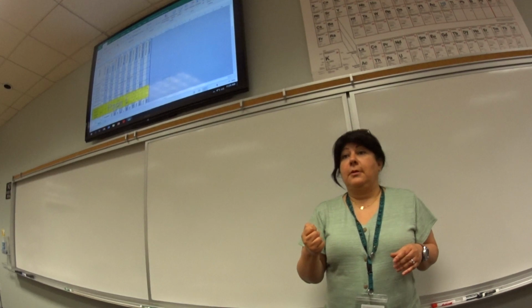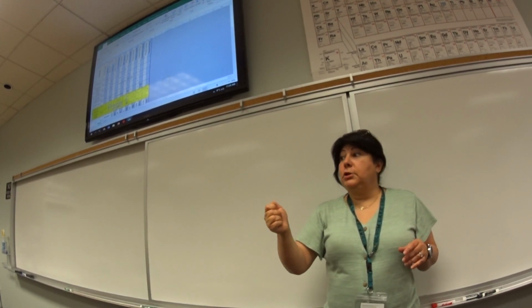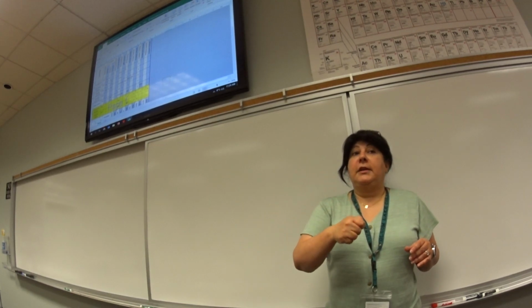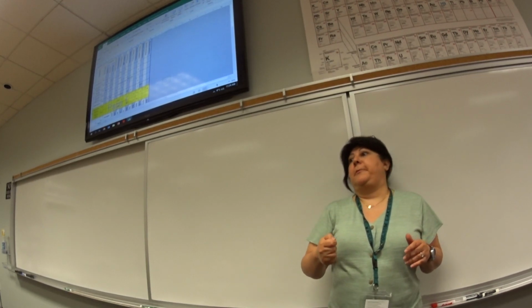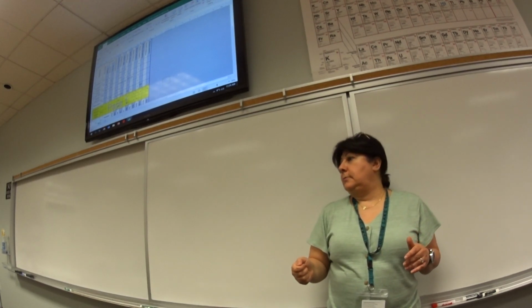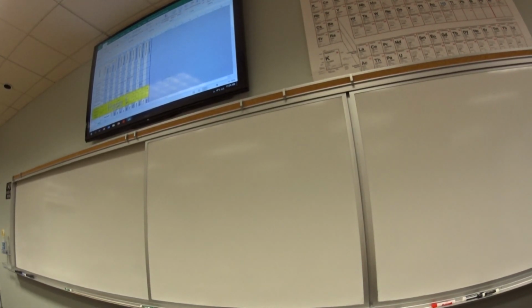On that day, Monday, when you're starting, make sure your loop is nice and clean. Then when you're inoculating, heavily inoculate. Take a big goop of it and add it to MRVP. Take a big piece of that and put it on EMB. You want to make sure that you transfer a good amount there.